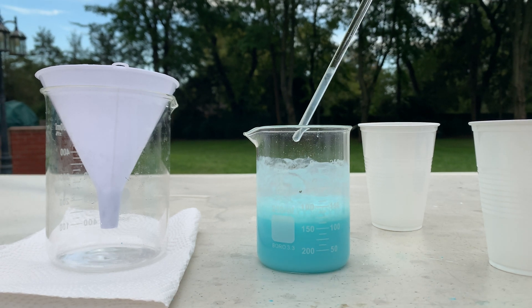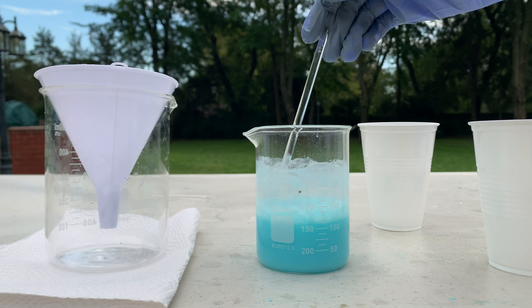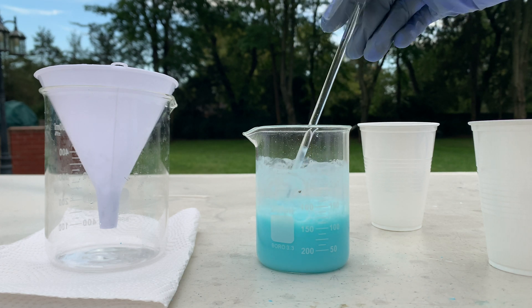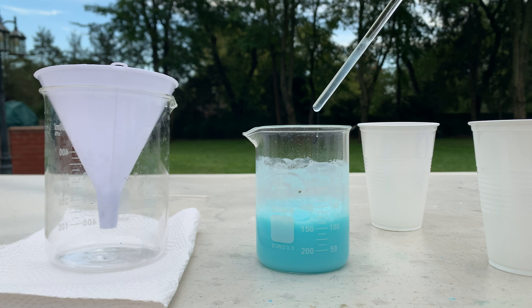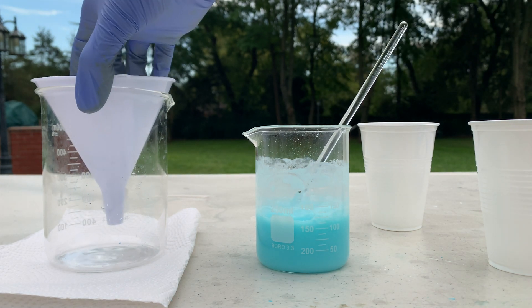I'm going to keep on mixing this reaction and let it sit for a bit to let the copper carbonate precipitate, and then we're going to let it filter through some filter paper.